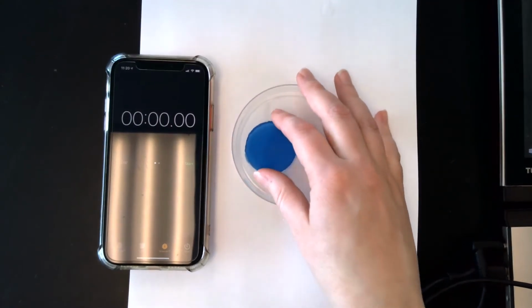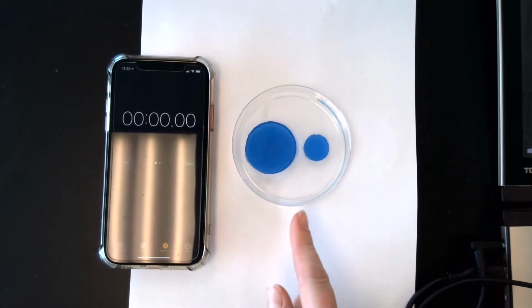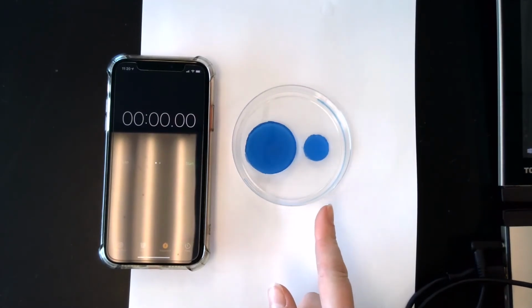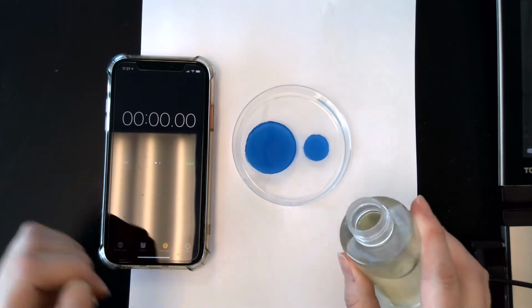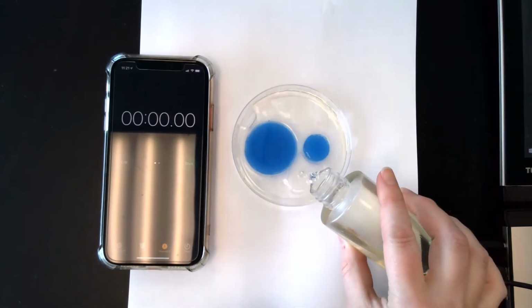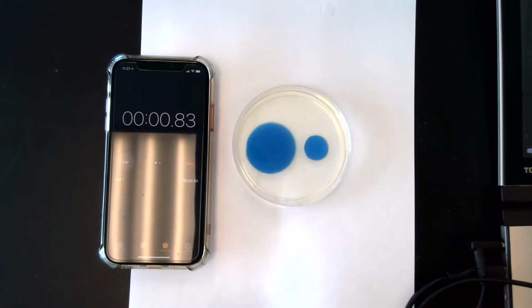What you should do on your lab assignment is predict which one is going to completely change first all the way. Okay? So I'm going to add my vinegar until they're both covered and start.